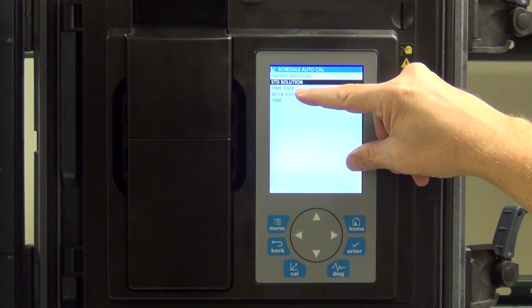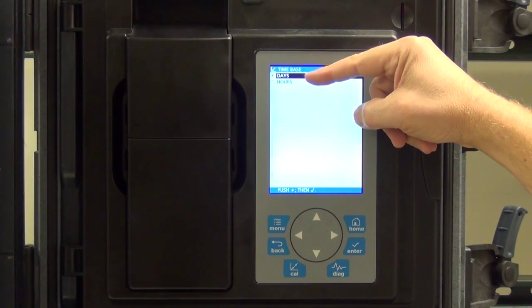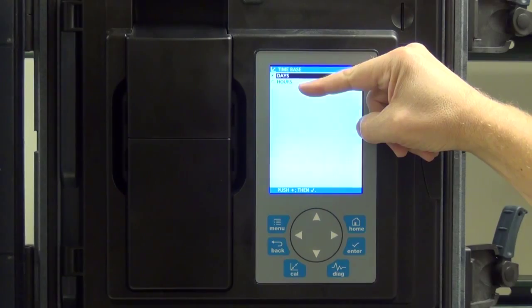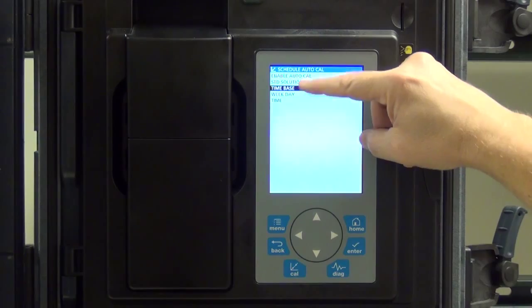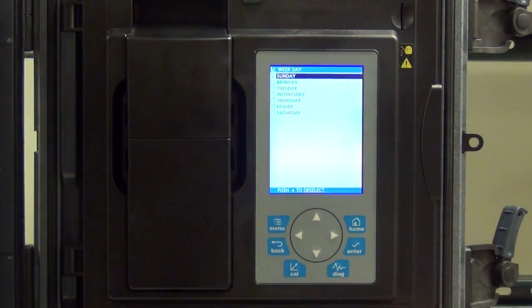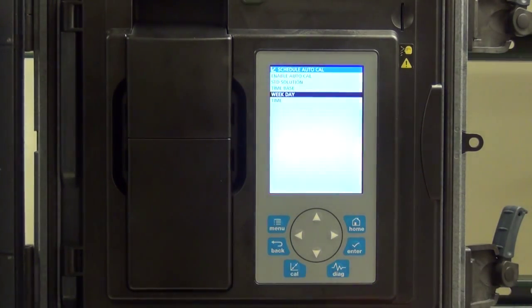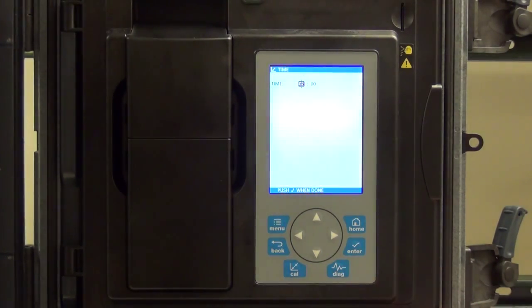The auto calibration can be set up on 2 different time bases. Either by days of the week, the default being Sunday, or we can change it to a number of hours. Notice it's currently set to days, and we have a weekday set up where we can choose the days of the week that the calibration is performed. So Sunday is default. Also, if you're doing it by days of the week, you have the ability to choose the time at which the calibration is performed. The default is 2 o'clock in the morning.